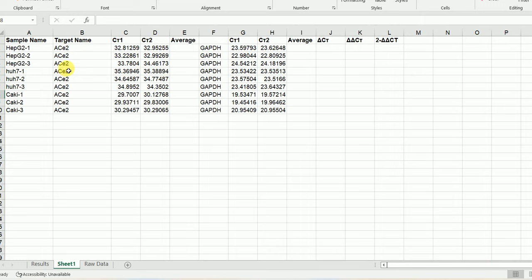To make the calculation much easier: sample name, target name, Ct1, Ct2, average — and Ct1, Ct2, average. I have put the sample name here, and here we have the target name, and here one Ct value and another Ct value from one technical replicate and from another technical replicate. Here we'll calculate the average. ACE2 is our target, GAPDH is our reference gene, against which we will normalize our Ct values.